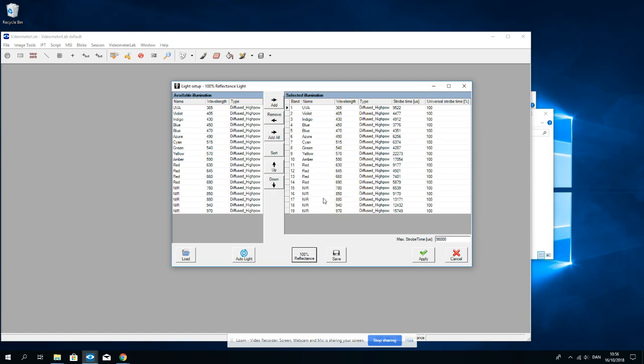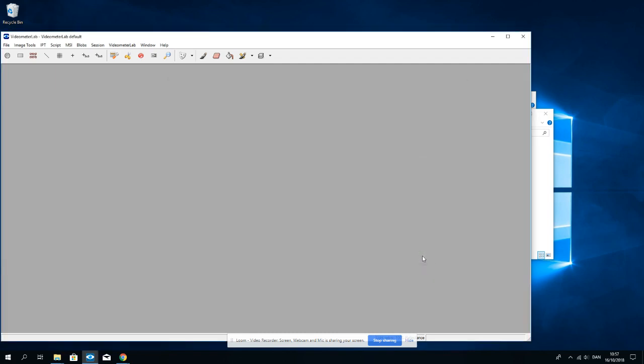Or we can customize the light setup by putting in a representative sample and do auto light. Today I will just choose 100% reflections and apply.